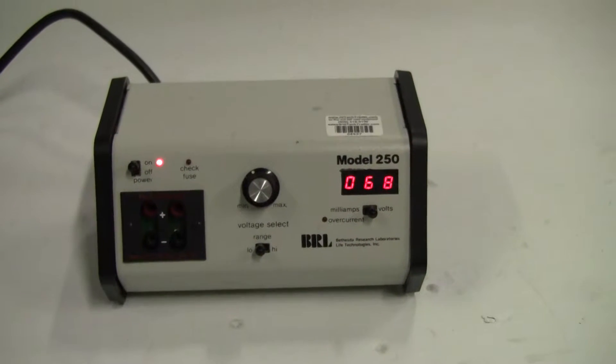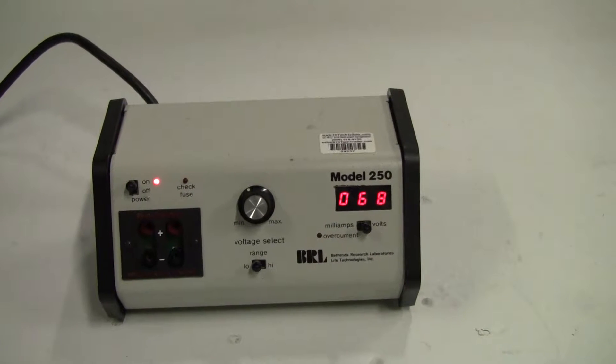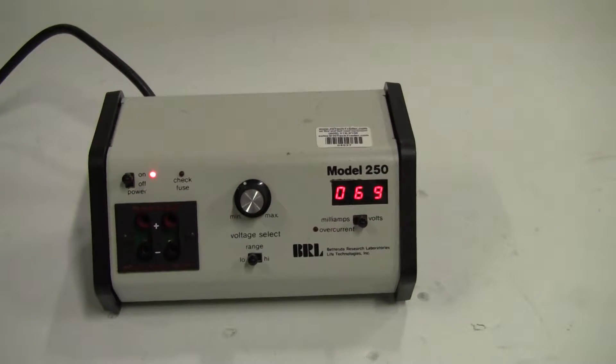Hi, this is Michael from HiTechTrader. Today we're looking at an electrophoresis power supply. It's a model 250, a very common electrophoresis power supply.